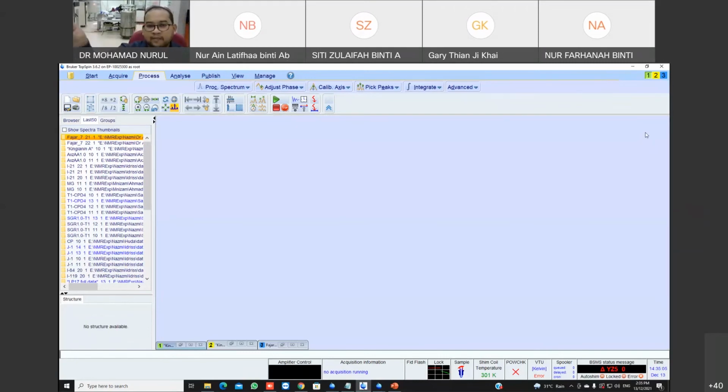In our NMR room, we have workstations, around 5 workstations. Just bring the pen drive, sorry, the French call it key. Okay, pen drive, you can directly transfer your data from our secondary computer to your pen drive.